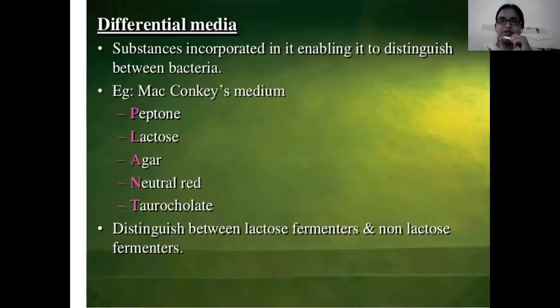Next, differential media. Differential media is used to distinguish between two types of bacteria. It is used to differentiate between different types of microorganisms. That is why it is called differential media.